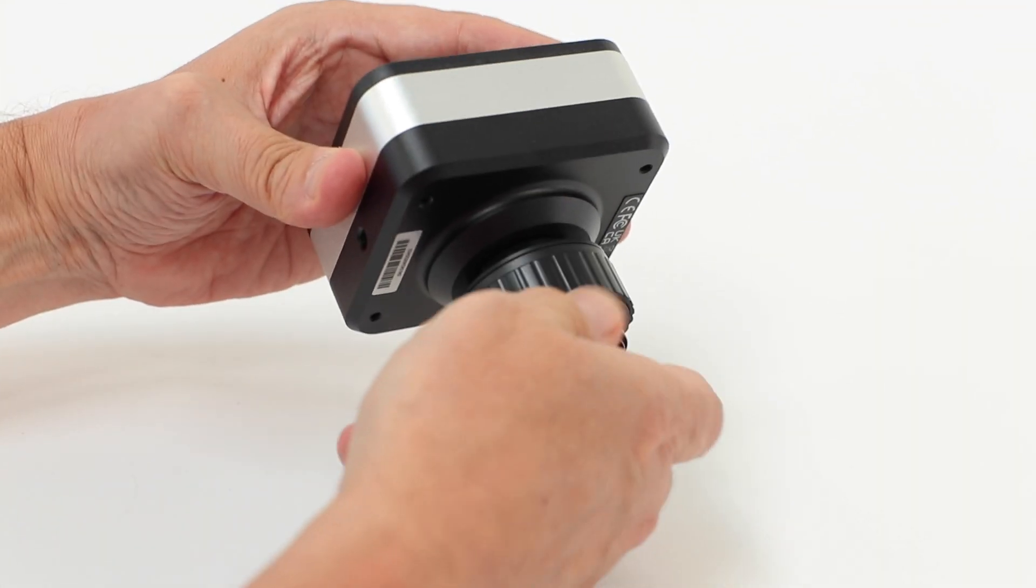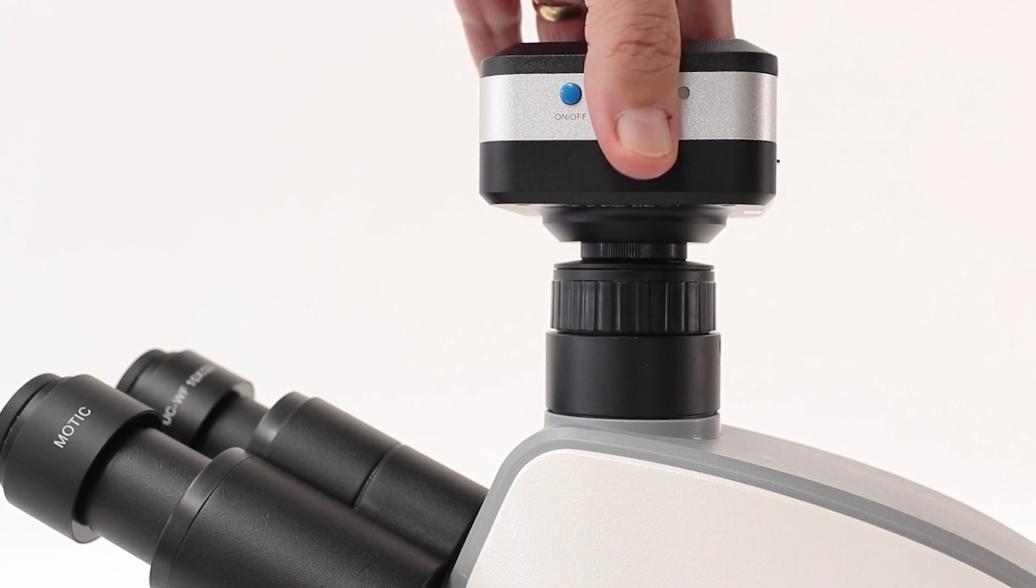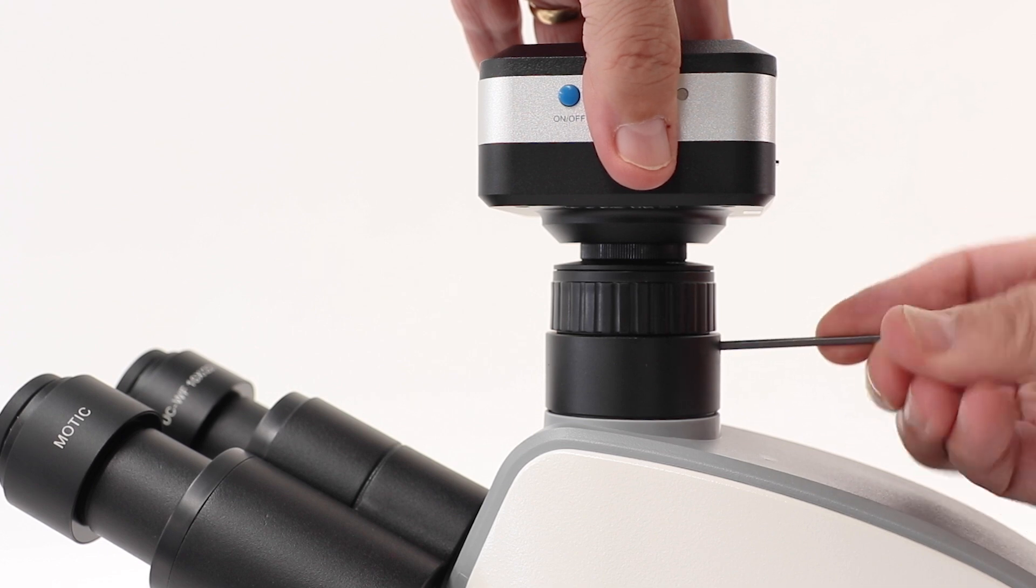First, attach your camera to the adapter. Then place the assembly onto the microscope's trinocular port. Secure it using the allen key provided.